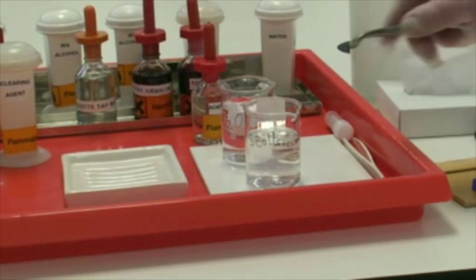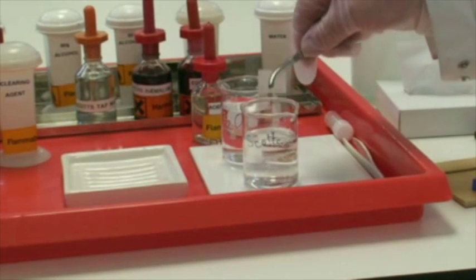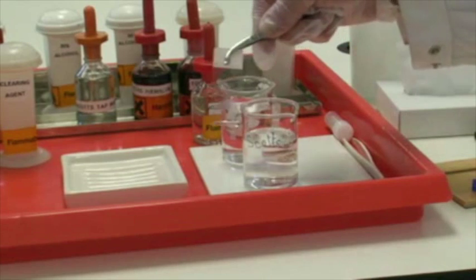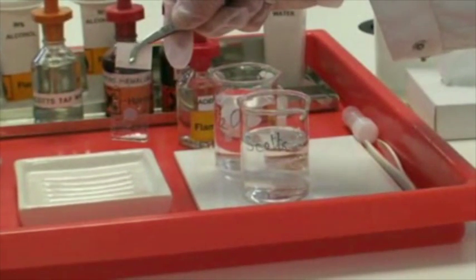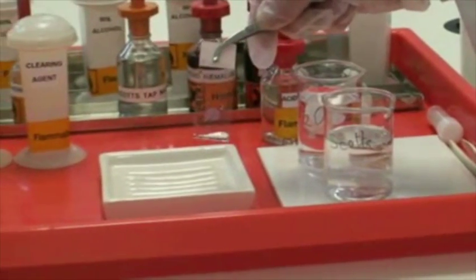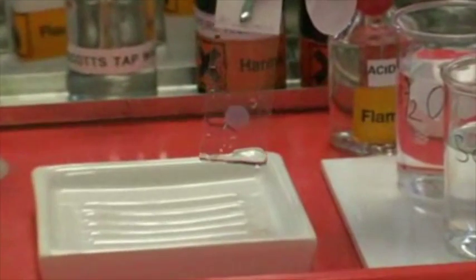We're now going to remove our section from the Scott's tap water. You'll notice it has taken on a bluish hue, and all of the nucleated elements within the tissue will have been stained.